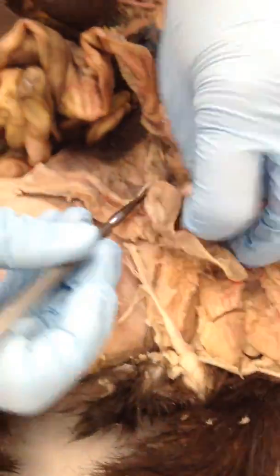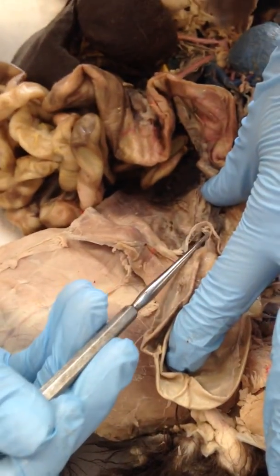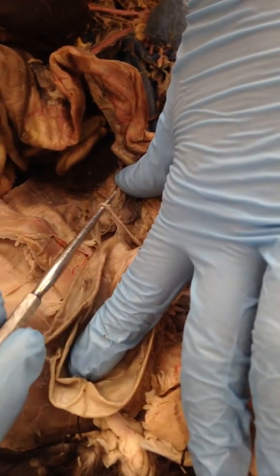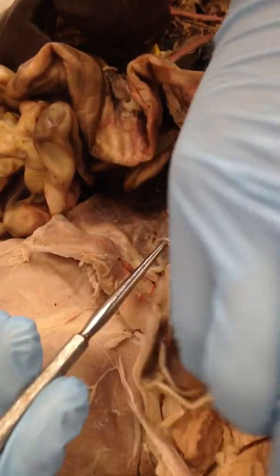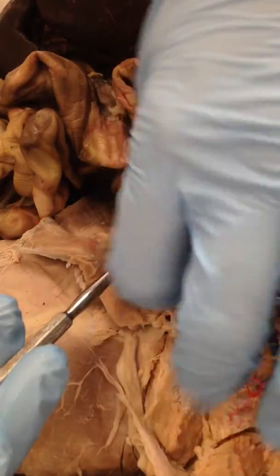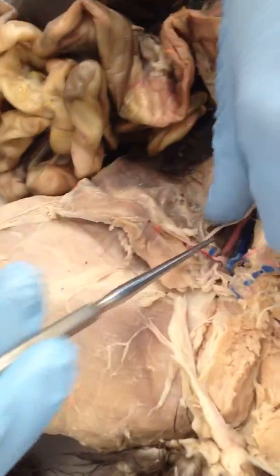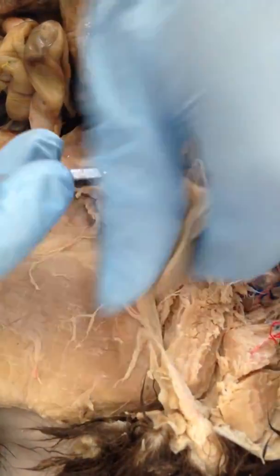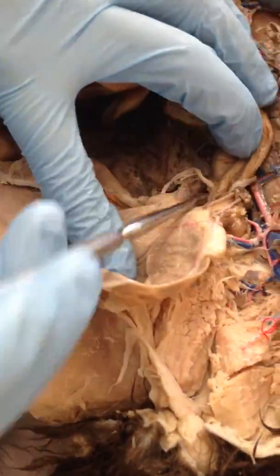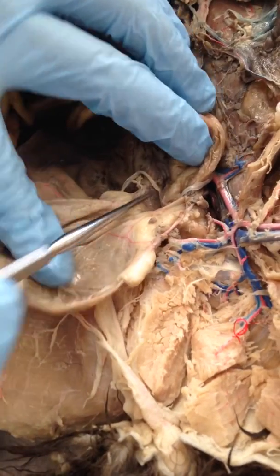Okay. Is this some sort of...? Yes, it is some sort of... It's a vas deferens. Is that what goes into the testes? What comes from the testes to the urethra, it transports sperm out of the testes to the urethra there. That's the vas on that side, and there's what should be one on the other side. So it's one big loop, right? Forms a loop.